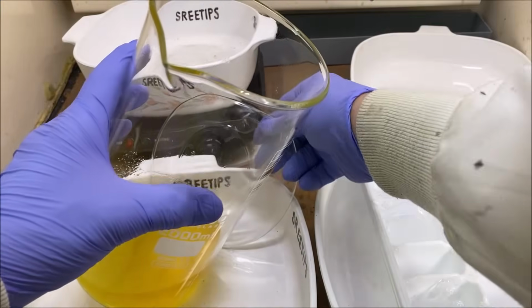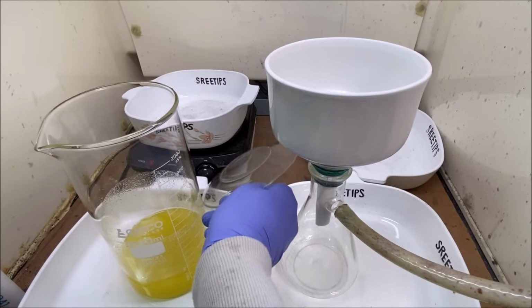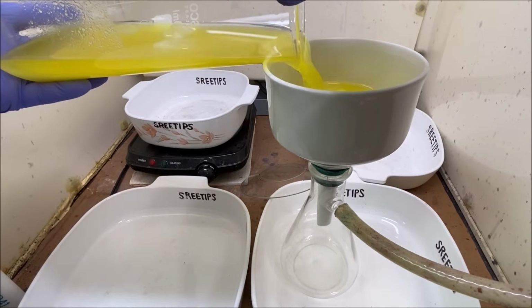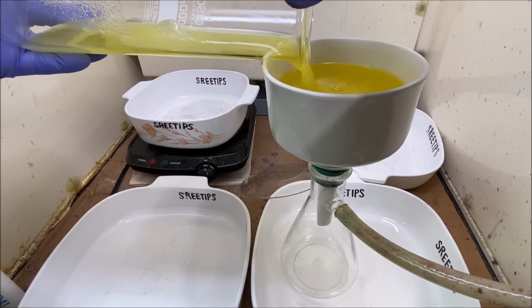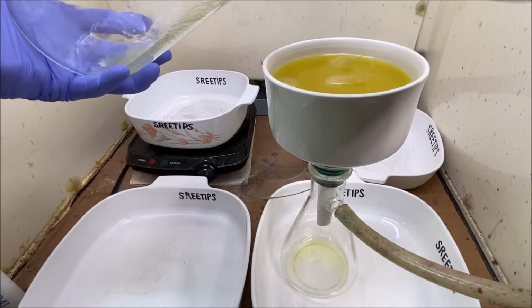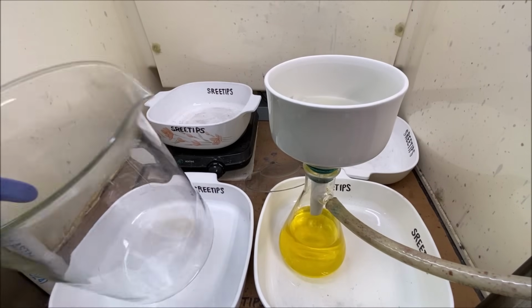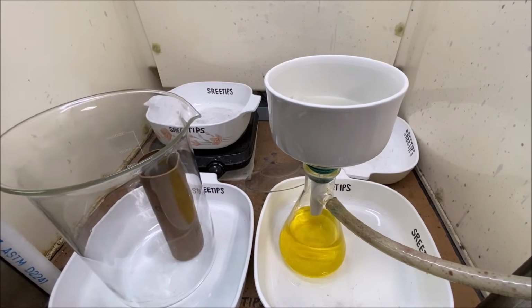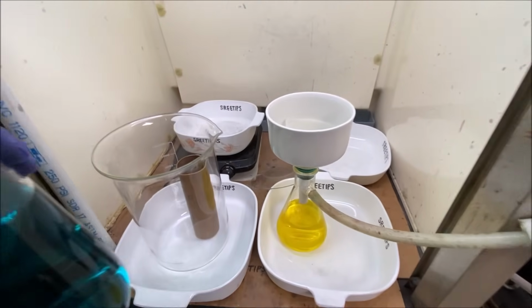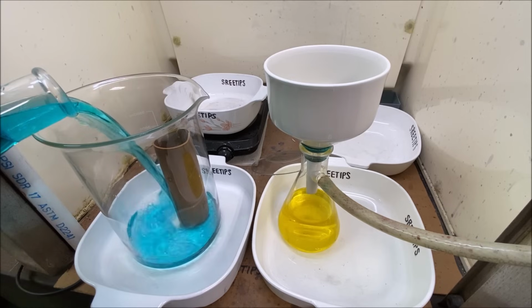It's down to room temperature almost. I'm going to add a few pieces of ice. While I'm waiting for the solution to filter, what I'll do is put a piece of copper in this clean beaker, and now I'll add the solution that we filtered earlier. It should just contain silver, so we'll cement the silver out on this piece of copper and recover the silver.